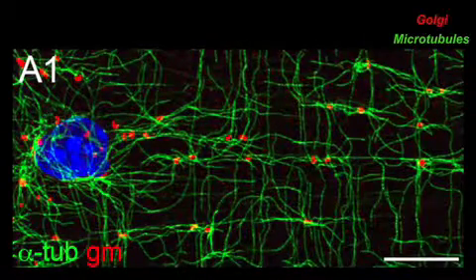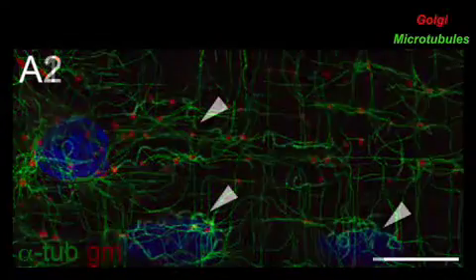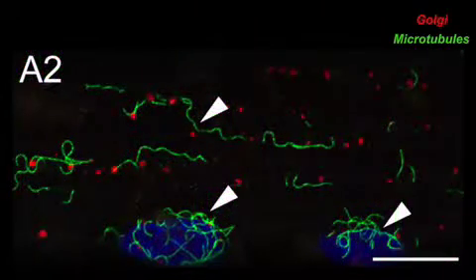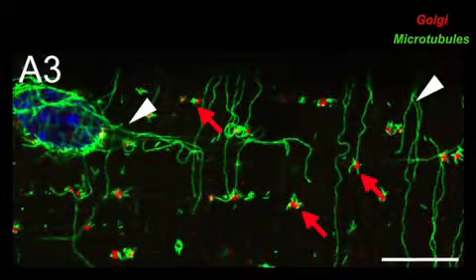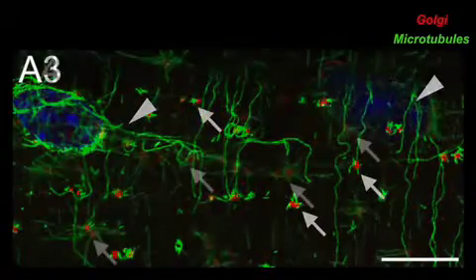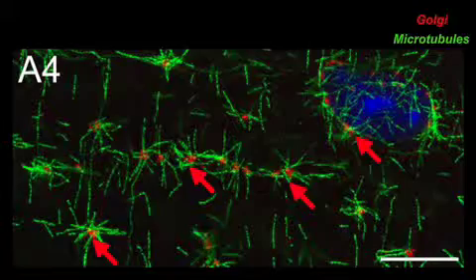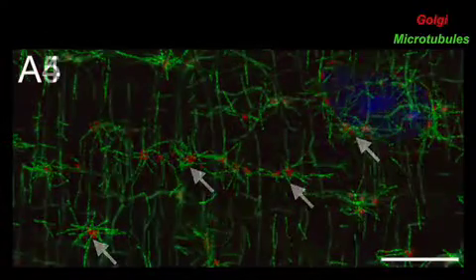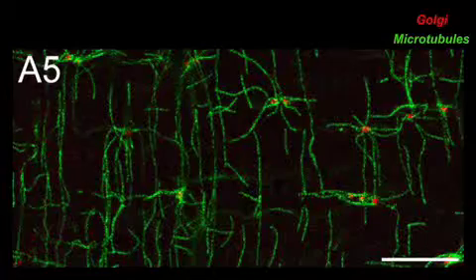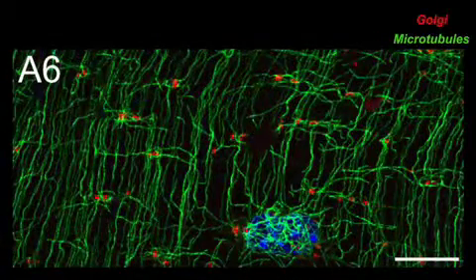So we treated the fibers to completely depolymerize the microtubules, and then we let them repolymerize. And we noticed that at very short times, we start seeing very short microtubules around the Golgi elements. And a few minutes later, you see very clear asters sticking out of the Golgi elements. So that indicated that the nucleation of the microtubules is done in association with the Golgi elements.